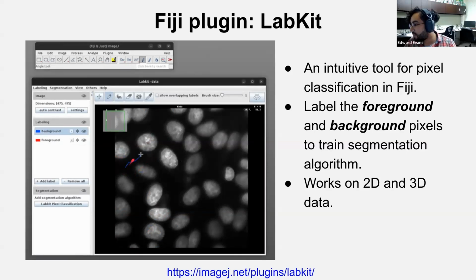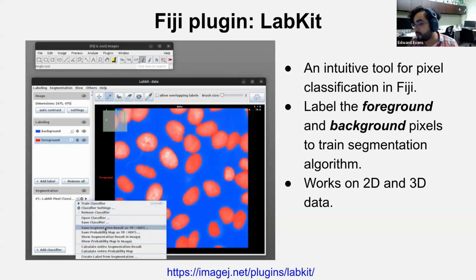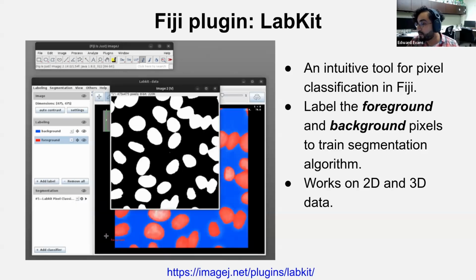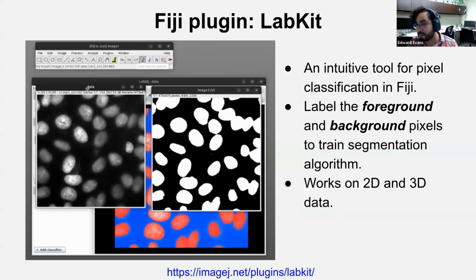And so I'll let that run again. So there you go, I do that, and then I select this other thing, say that's the foreground, and you just let it go. And it produces a result like that, which is really, really quite nice. So if you haven't played with that, give that a whirl. Maybe that might help with your current segmentation issue, but it's worth a try.